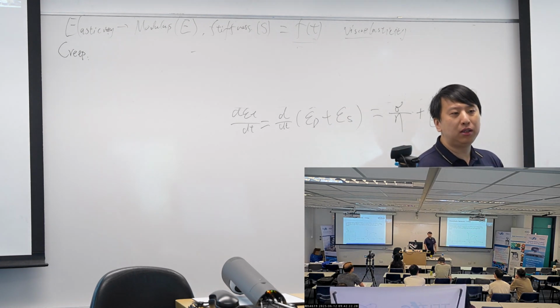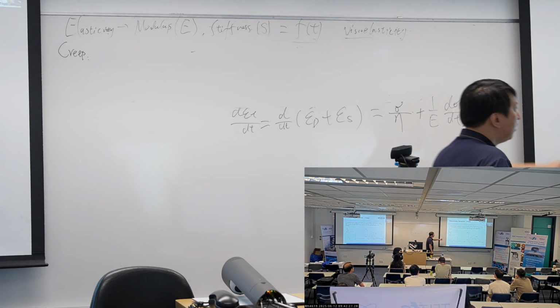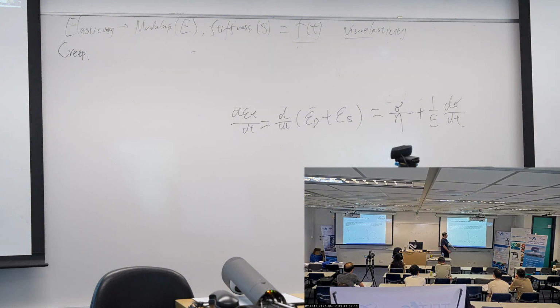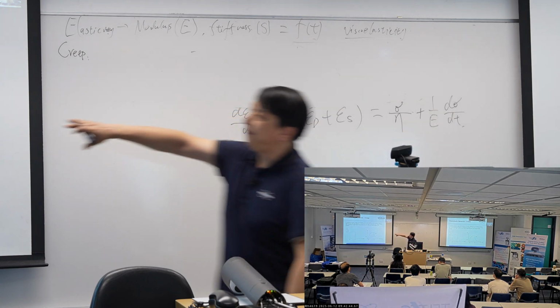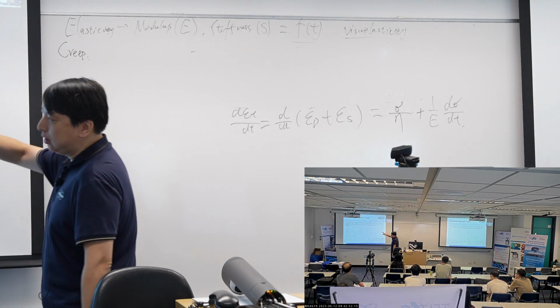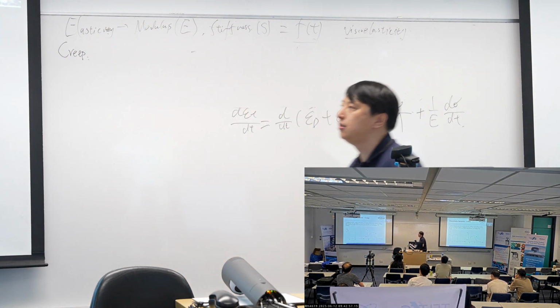That means the material is like a worm, just moving slowly. So he called his experiment creep. He needs to hold a force at a certain level and see how the deformation changes during the hold. To solve this, his total idea is I need to get this equation out, so I need a better way to describe the epsilon change, or the deformation change.